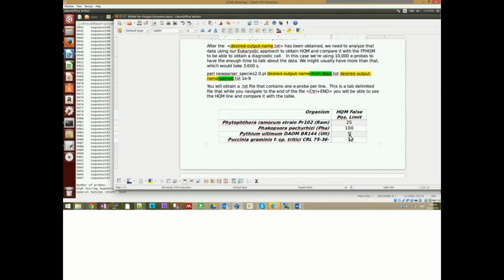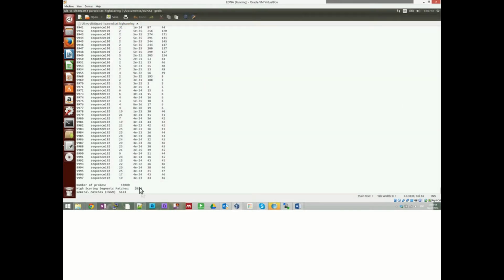Or it might be other eukaryotic reads hidden here. So since we have way higher than 5, in this case 3,000, it's highly likely this is positive. I would call it very positive in this case.